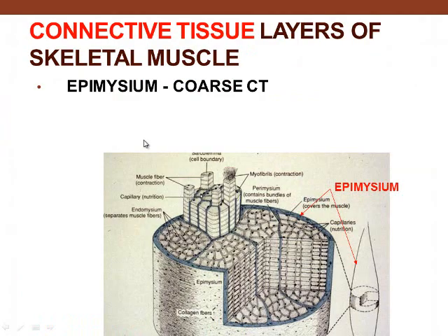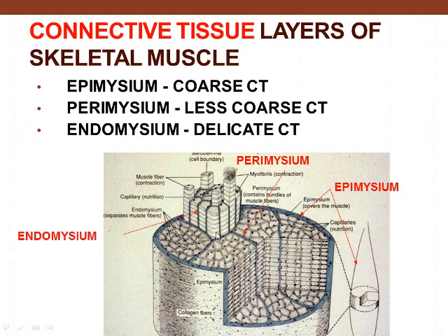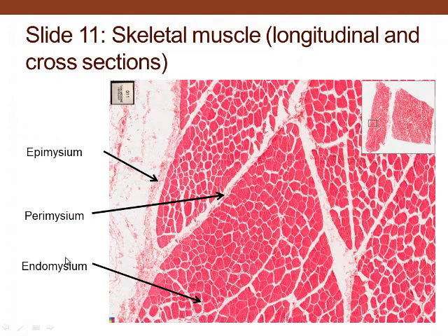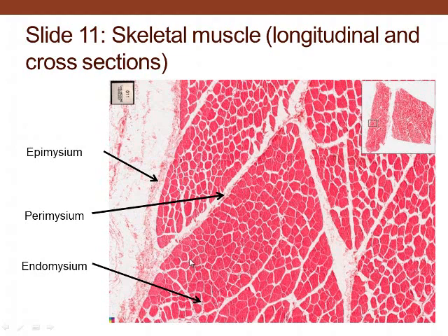The different connective tissue layers: outside the muscle is the epimysium. Then you have divisions inside — that's the perimysium. Around individual muscle fibers is the endomysium. Looking again at slide 11, the epimysium is the connective tissue outside, the perimysium is the major connective tissue in through there, and the endomysium is the connective tissue that houses the blood vessels surrounding individual muscle fibers.